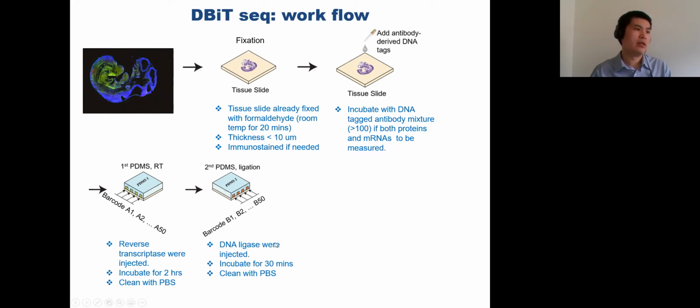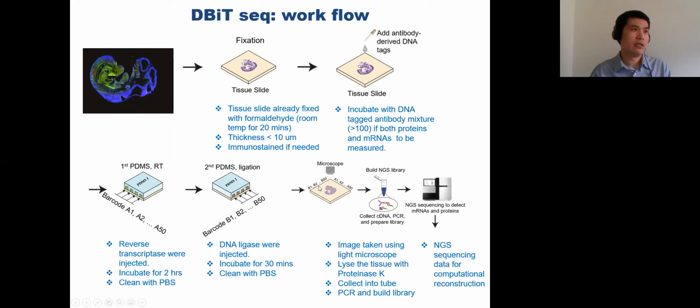Then you can have information about the second dimension. So incubate for another 30 minutes, just to clean up. Then I think the tissue is ready to be either imaged or lysed, then collected into a tube, then doing all the things you do for a single cell RNA-seq.